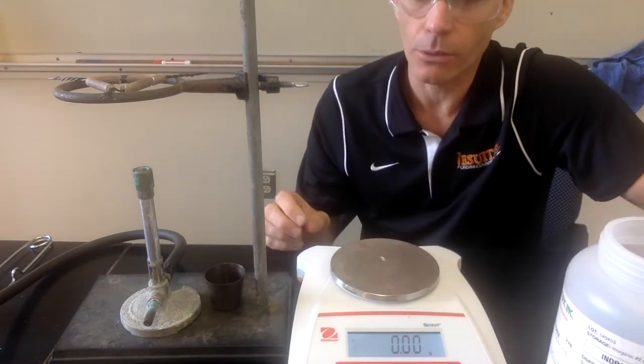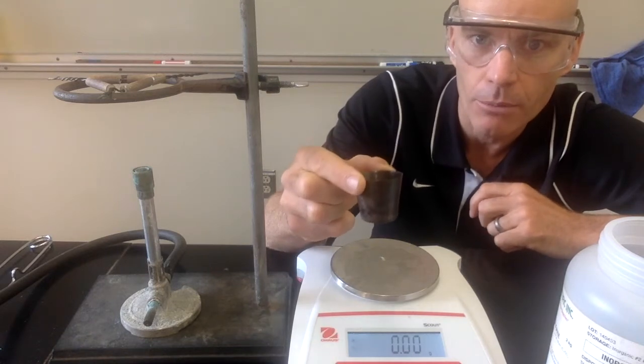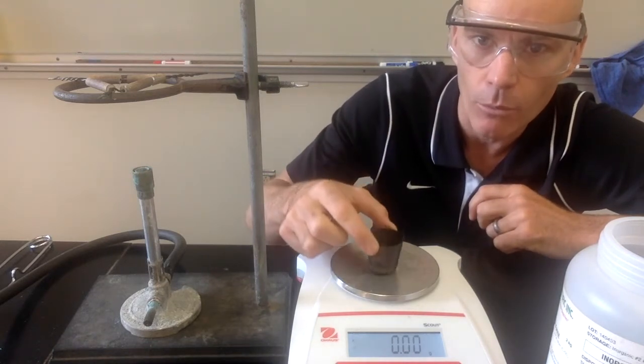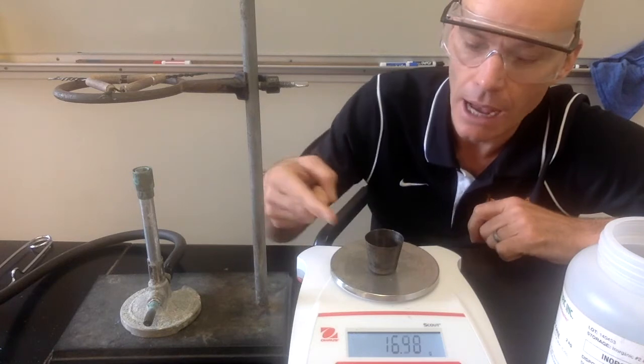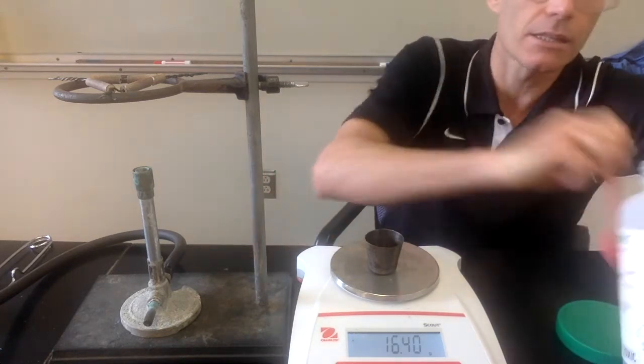To do this, we're going to first take a crucible. A crucible is a container that can withstand pretty high temperatures. We're going to find its mass — this is the mass of the empty, clean, dry crucible. We'll record that in your data table.